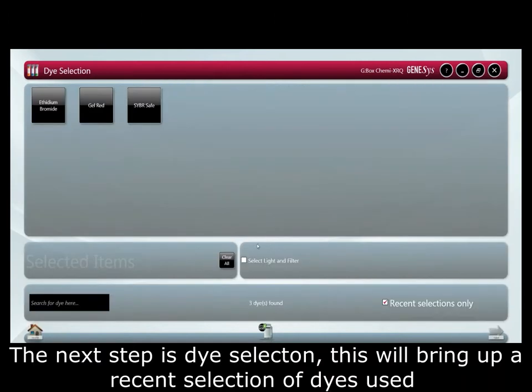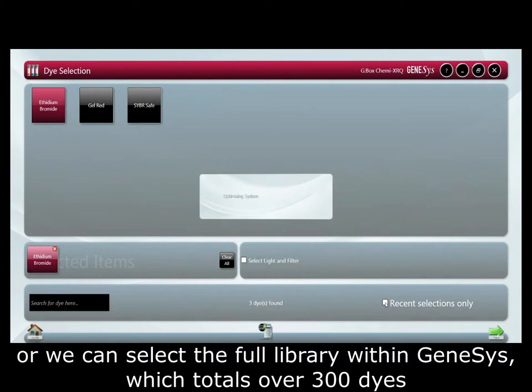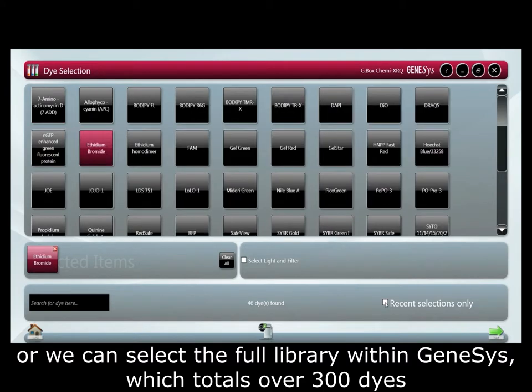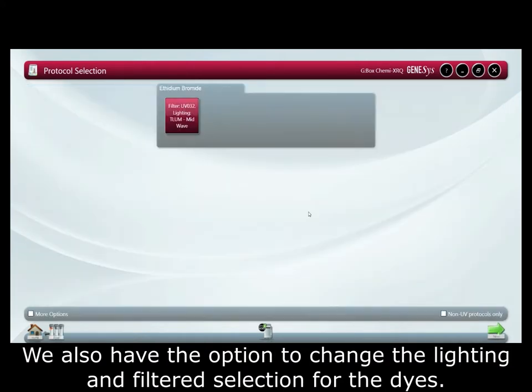The next step is dye selection. This will bring up a recent selection of dyes used or you can select from the full library within Genesis which totals over 300 dyes. We also have the option to change the lighting and filter the selection for the dyes.